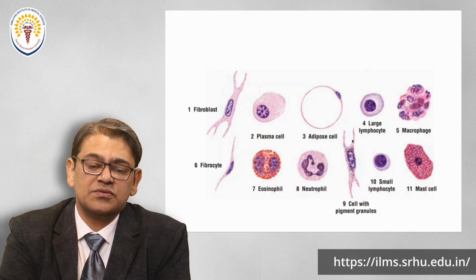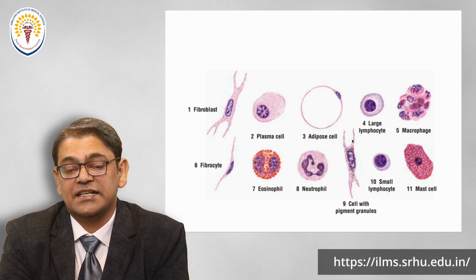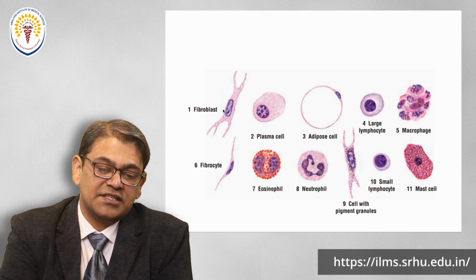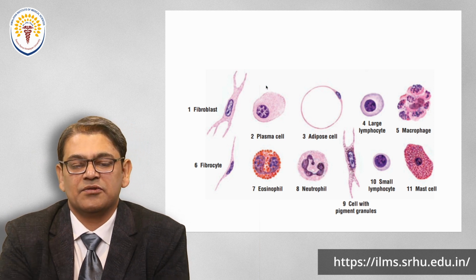Now it is time to visit a couple of the cells. What are the cells present inside and do they have any importance? Let's see them one by one. Fibroblasts: if you see, these tongue-shaped structures are the fibroblasts.